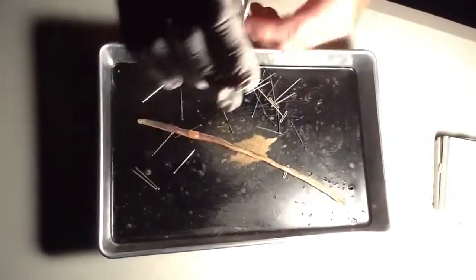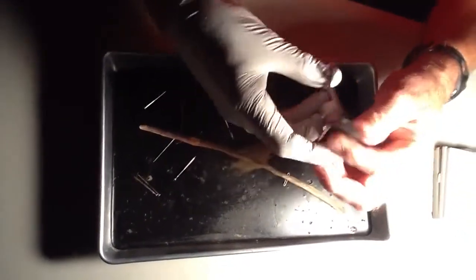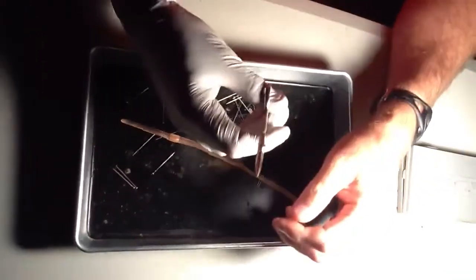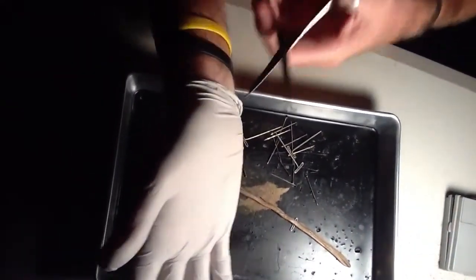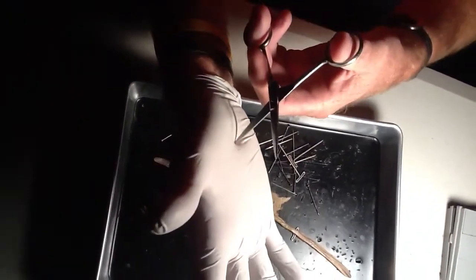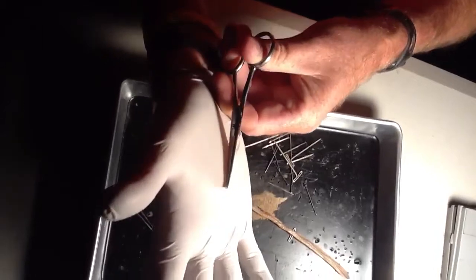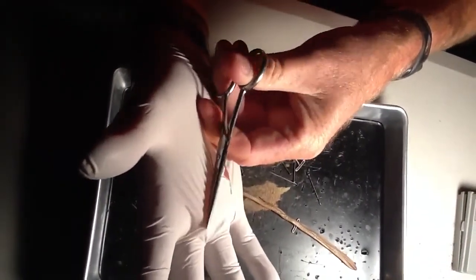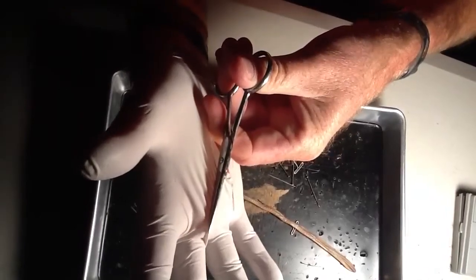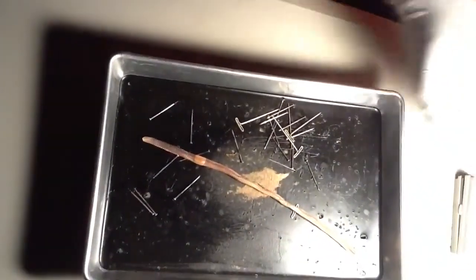Yes, no? Okay. What we're going to do is use the scissors to cut them open, not the probes, because these are a little tougher skin. But what you need to understand is I don't want to cut down. Like, I'm going to cut this glove off. I don't want to cut down into my hand, so I want to cut just the glove. Does that make sense? So I'm going to lift the skin. I don't want to dig down because I don't want to get into the organs. That's why I'm actually wearing the glove, is to show that.